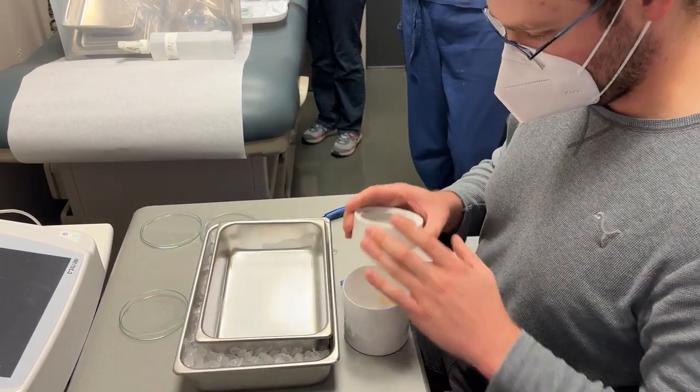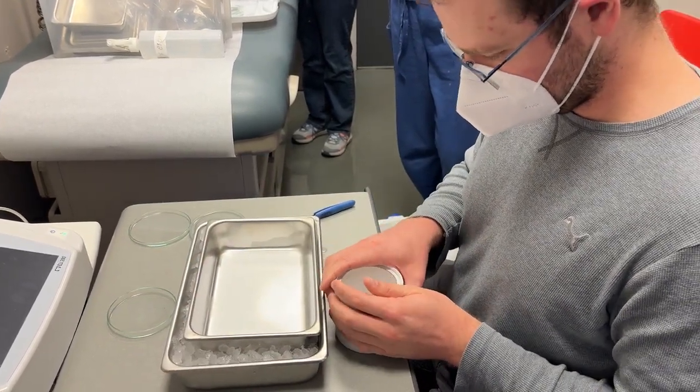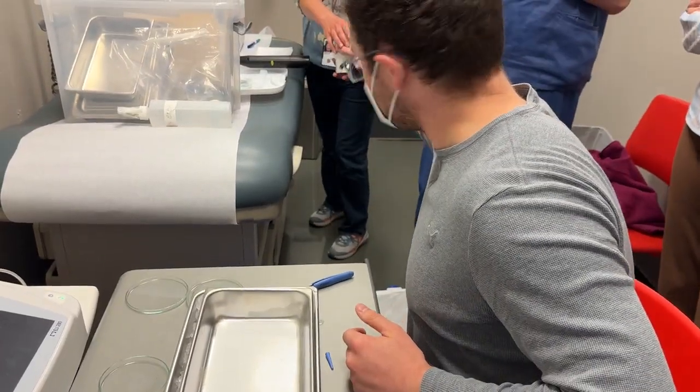It's going to get a biohazard label, and we are going to take care of it for 14 days, and then we will determine if it is infected or not.